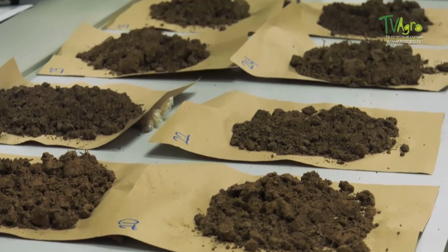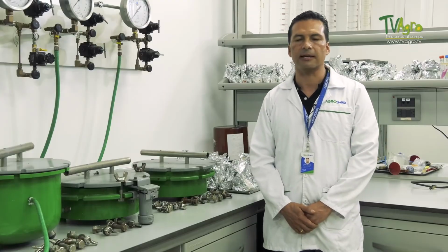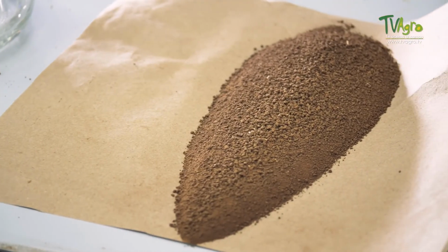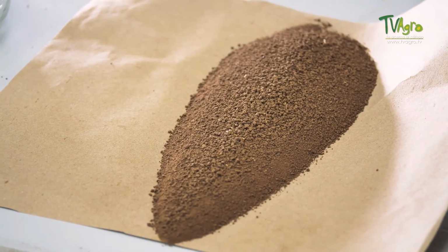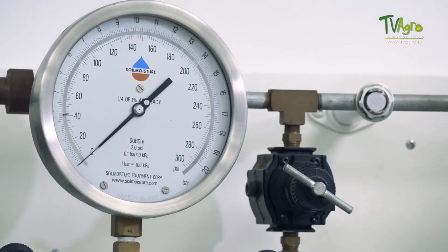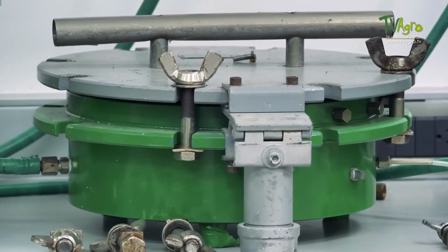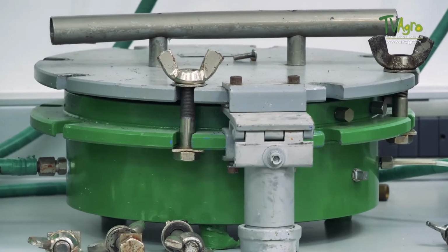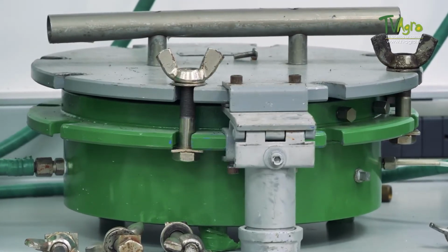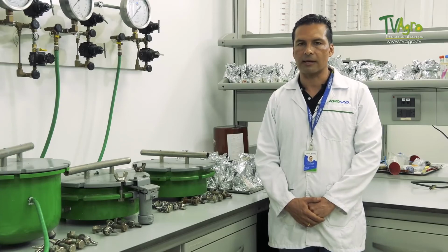We have the texture by Bouyoucos. We have the determination of real density, apparent density, and soil aggregate stability. Within these tests that help us determine whether a soil is suitable for a particular crop or not, is the soil moisture retention, which is a simulation of how much moisture a soil can retain at a given time, and that also gives us an indication of the irrigation needs to be done to that soil.